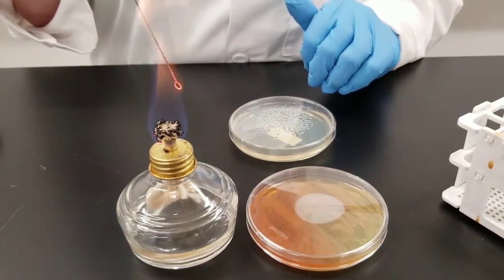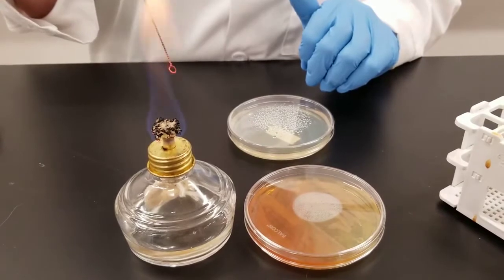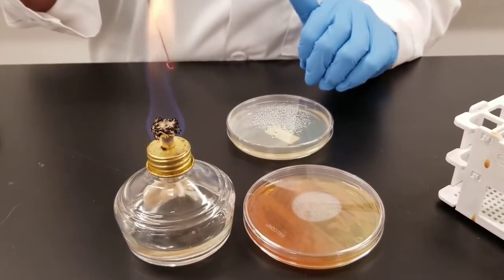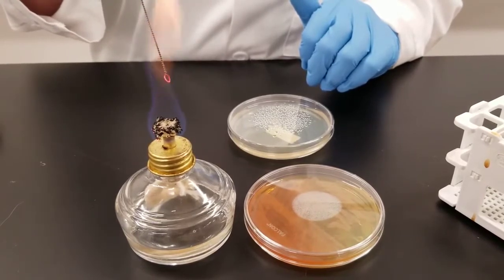The idea is you're diluting the bacteria out, so at the end you will have isolated colonies. Each individual colony arose from a single individual bacteria and is a pure colony. So if you have a mixed culture, this is an easy way of trying to isolate out and get your pure culture.